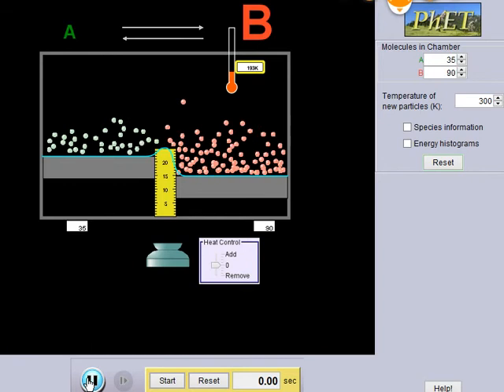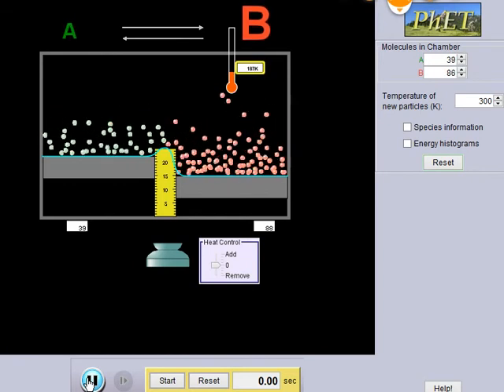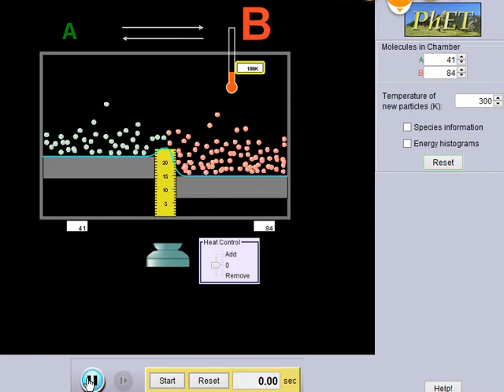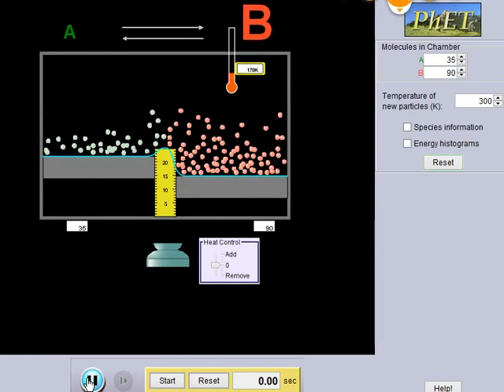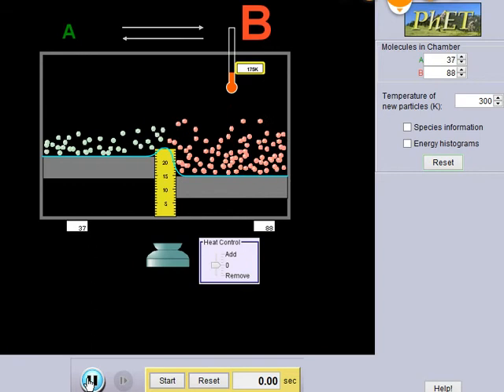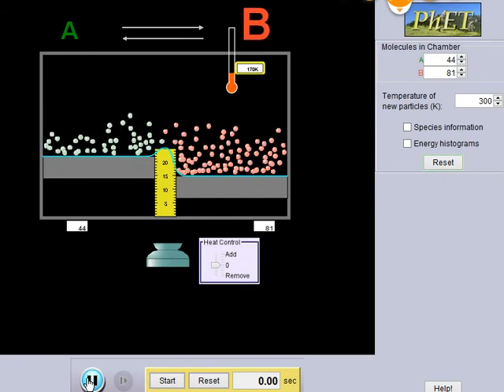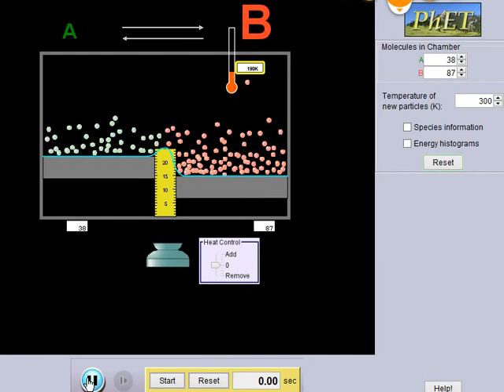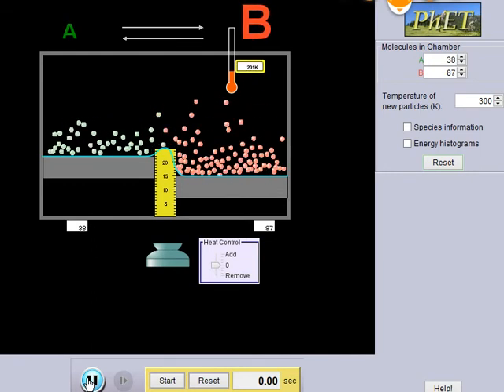So let's wait. Play the waiting game. And while this happens, I will explain to you why it's not exactly 2, it's a bit up and down. That's mainly because, if you remember from our classes, the equilibrium constant K is dependent on temperature. Yes? And as you can see, the temperature is moving up and down. It's not at a constant temperature.